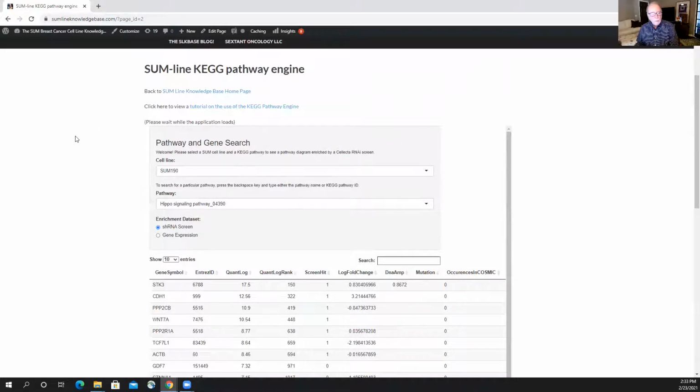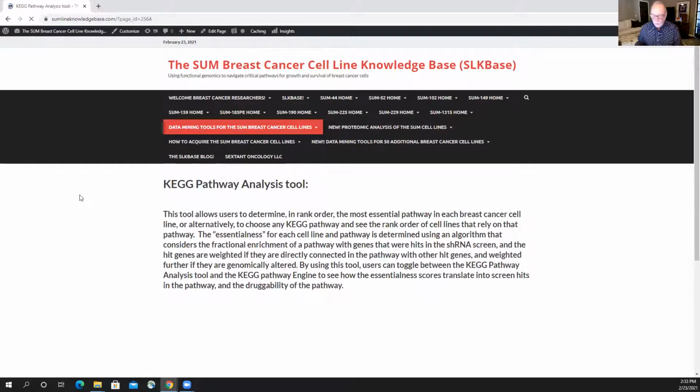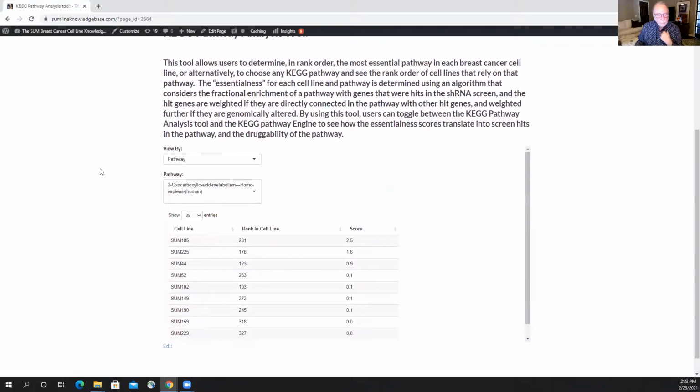I want to take you back to this one, because I want to just show you, using this analysis tool, some interesting discoveries. So, one of the things that I'm going to keep it by pathway for now.